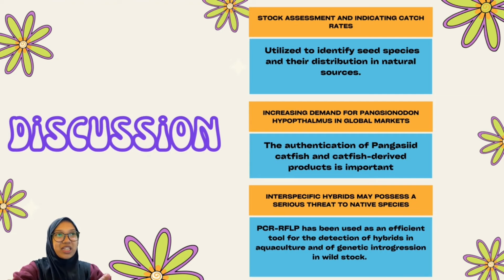These molecular genetic markers have facilitated the correct species identification of adults and early development stages, egg or larvae, of fish, which is useful for fishery biology studies.